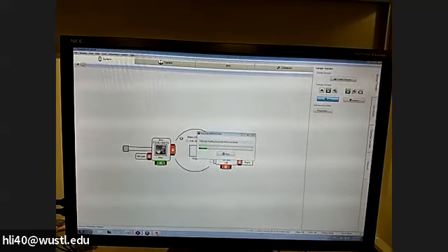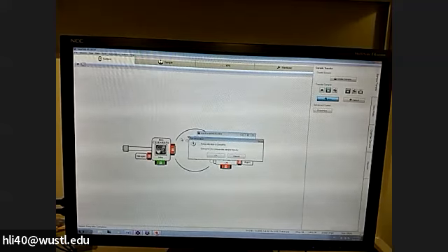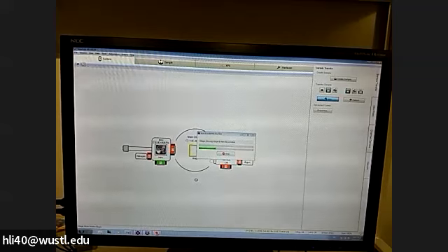And wait for the next pop-up window to instruct you what to do. It takes about 1 minute. Okay, so now it says pump intro task is complete. Select OK to continue sample transfer. Just click OK. It will take another minute to move the stage into place to make it ready for you to do the transfer. Just patiently wait for the next command.